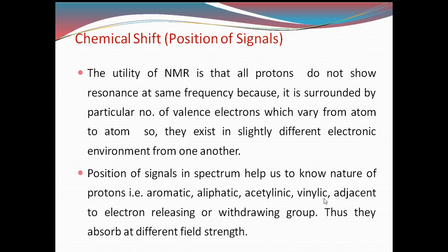When the precessional frequency of nuclei is equal to the frequency of the radio waves, in the radio frequency region, only then does the molecule absorb the radiation. That process is called resonance. Theoretically we will study more factors, but practically it may not be possible in all cases.